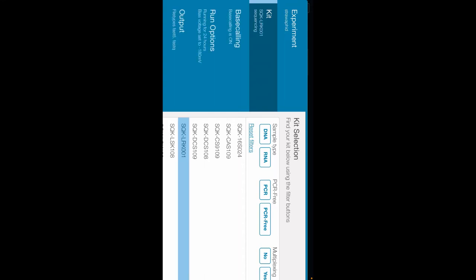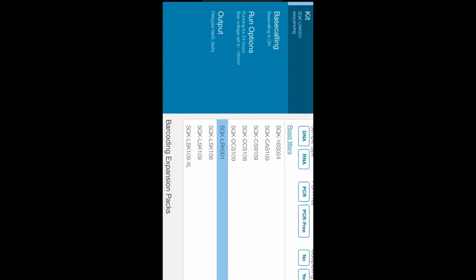I'm not going to click start run yet because what I want to do next, in the next two minutes here, is actually load the device with the sample. But it's all ready to go, just need to load it then click start run.